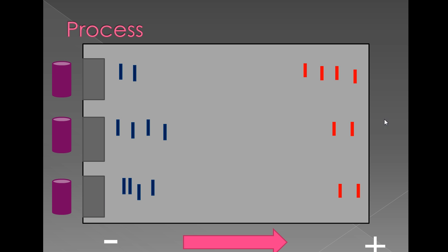And as you can see, I color-coded the DNA molecules. The red molecules were able to make their way all the way to the bottom of the gel, which signifies how fast these molecules are. And this determines that it has a high charge, it's spherical shaped, and it's small. Compared to the blue DNA molecules, it barely made it out of the well, and it's still in the beginning, and it barely touched the middle, meaning how slow these molecules are, which determines that it has a low charge, is rod shaped, and it's long.